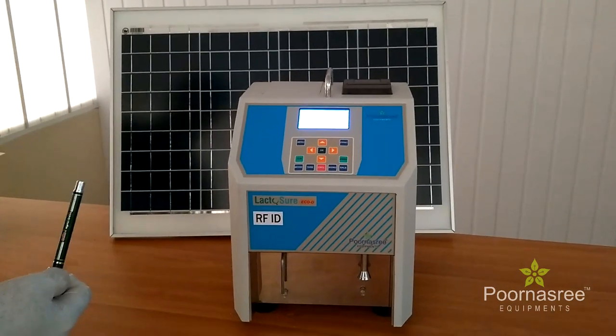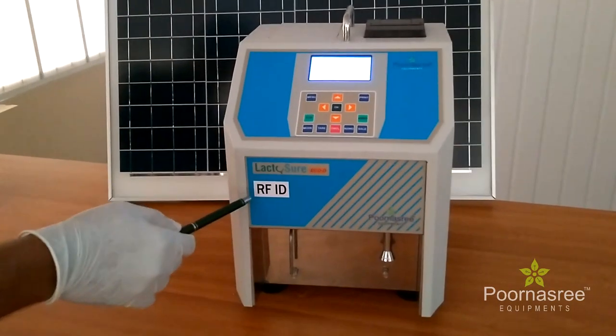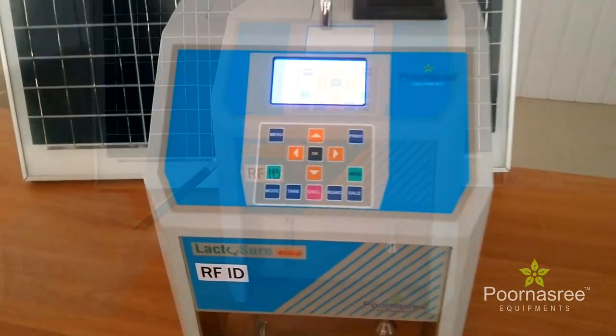In the GSM facility, by message every farmer will get their rate details and quality of the milk details in their mobile by message.